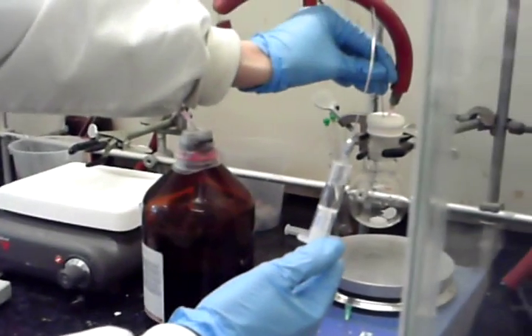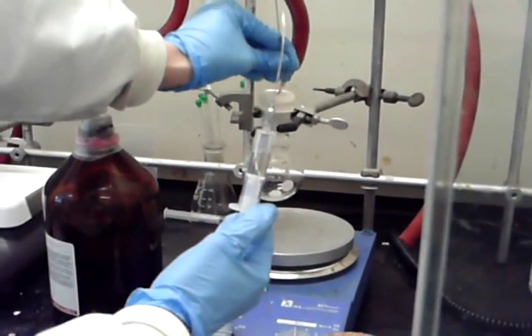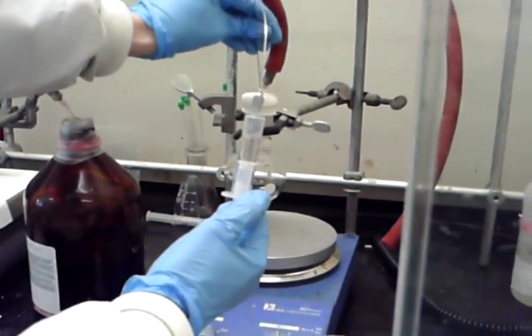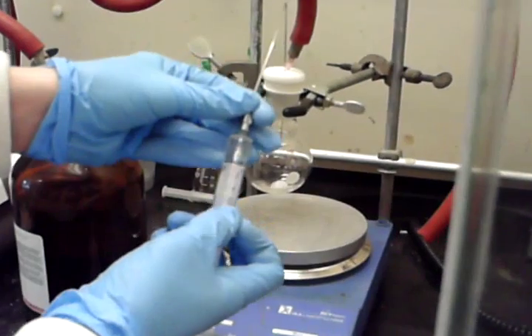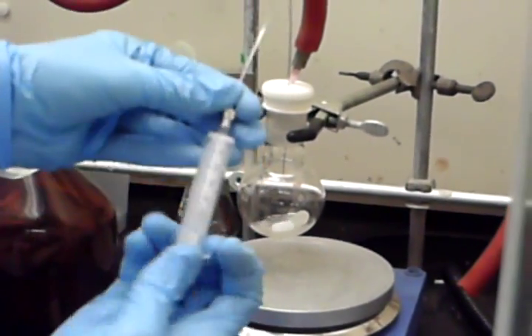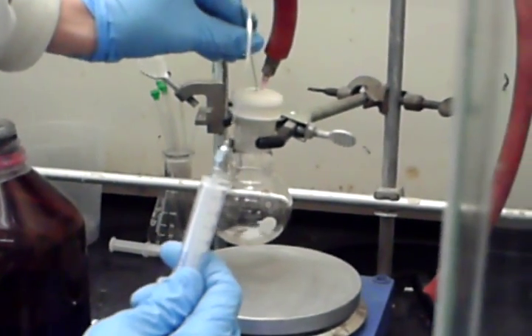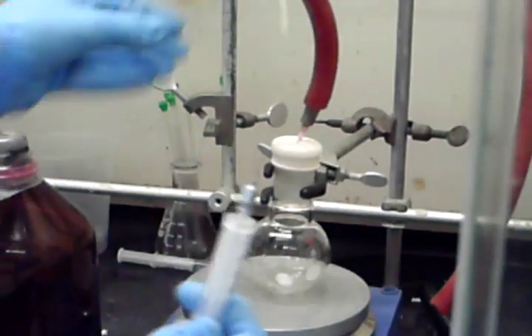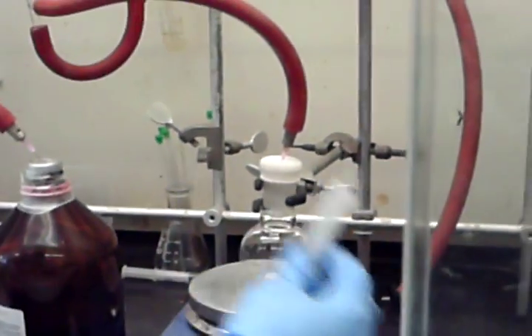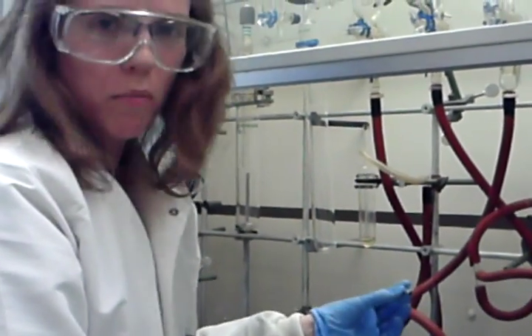Simply transfer over and push out. I have my two mils. Then pull some nitrogen in, pull the needle out, and remove it. Set that in the back of the hood, and then you want to rinse the needle immediately to prevent it from being clogged.